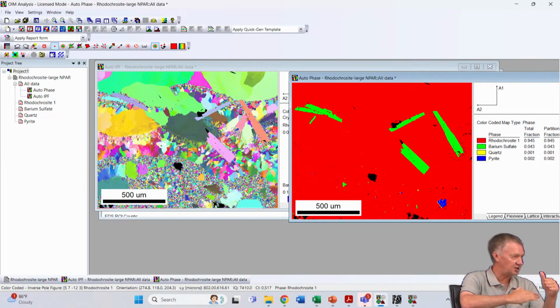You can measure that layer sequence, assuming you have enough spatial resolution, assuming your grains are large enough that you can actually do EBSD. Or you can do TKD maybe if you can't see them. That's transmission Kikuchi diffraction, that you do also in the SEM, that your techs know how to do well here. And then you would look at each individual phase and structure and look at the textures.